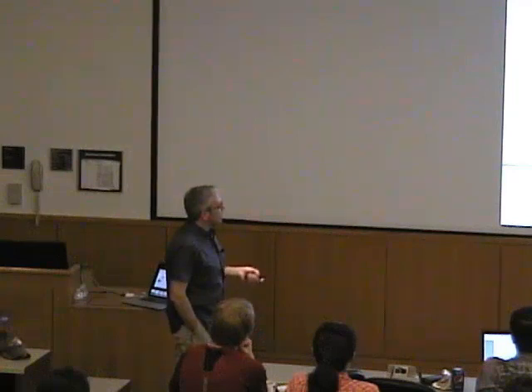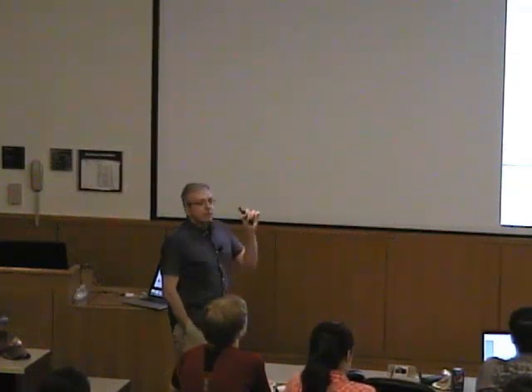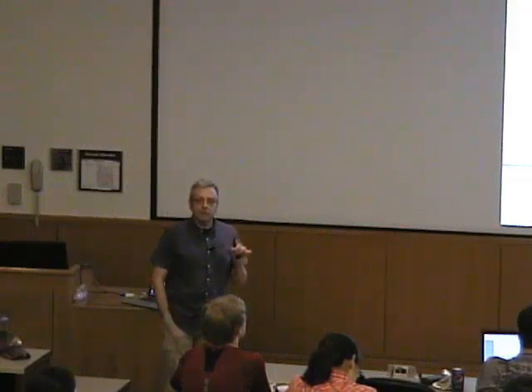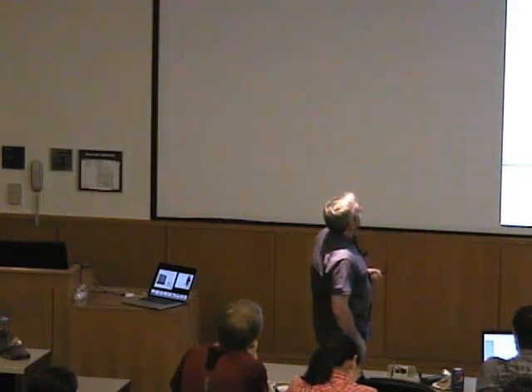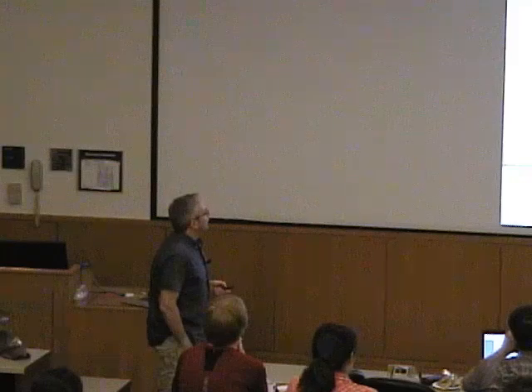And with the CMOS detectors, you're basically able to directly detect incoming photons or electrons on each individual pixel of the detector. You do not need to integrate, you do not wait over time, you just count what's coming in. These things look like that. They are pretty big and pretty expensive, so they're more something for larger research facilities than for your home lab.